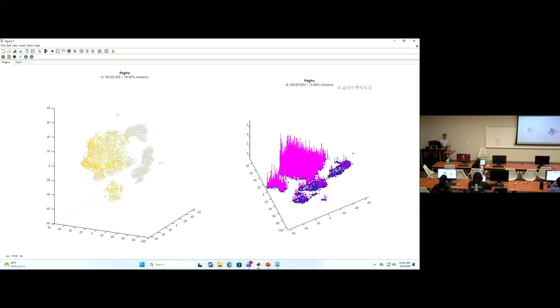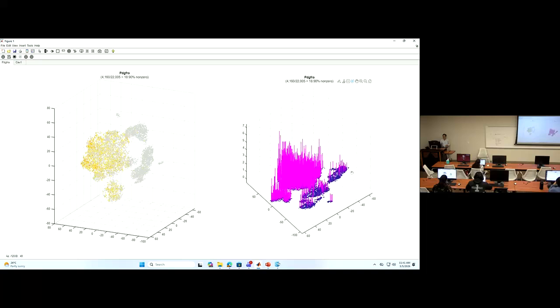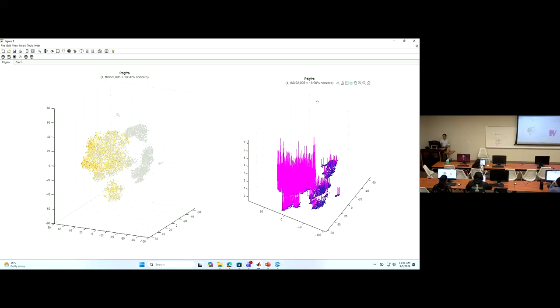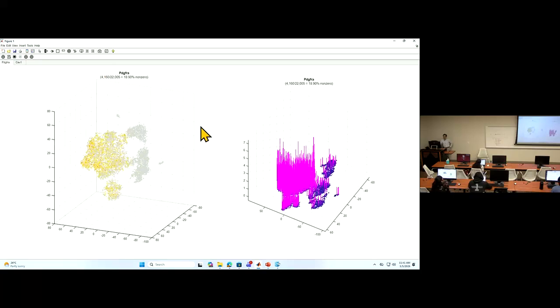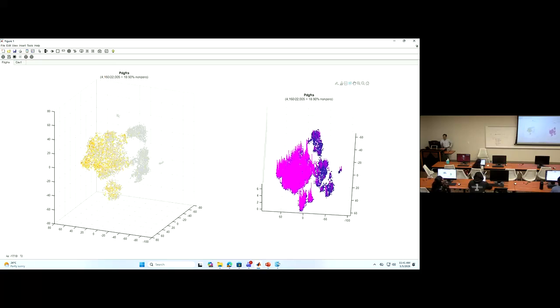And here is a 2D with a vertical bar indicating this gene's expression. The first thing I normally see is how many cells express this gene. So this is 18.9%, so there are 4,160 cells in our sample that express this gene. And they concentrate in fibroblast here.